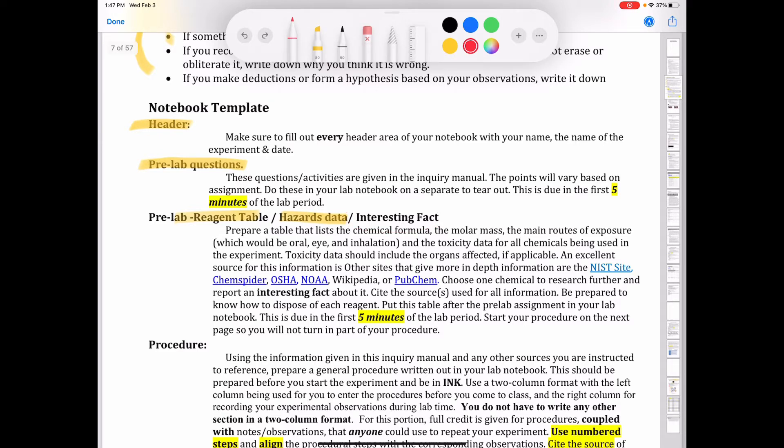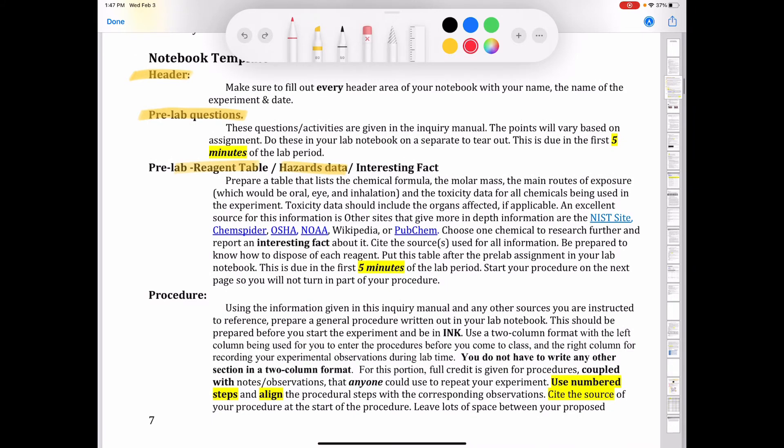Now, what is a reagent table? A reagent table is a table that lists the chemical formula, molar mass, and the main routes of exposure, and all the toxicity data for all the chemicals being used in the experiment. An excellent source for this information could be the NIST site, ChemSpider, OSHA, NOAA, Wikipedia, or PubChem. So you can use any one of those to find the information about all the chemicals that you're going to be using in this lab.